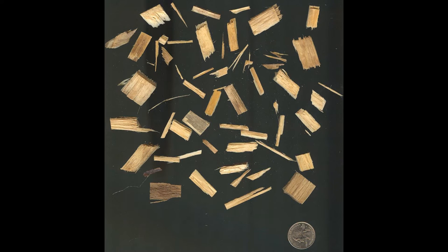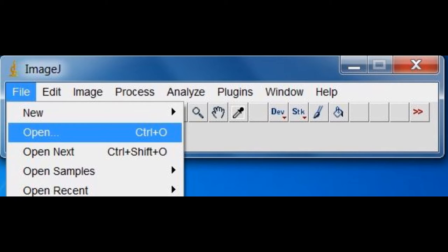Disperse the particles onto the scanner, making sure they are separated and easy to distinguish between the different particles. Include an object with an already determined diameter, like a quarter. Scan the necessary images into the computer to be used with the ImageJ software. With the proper image files and software on the computer, you should be ready to start your particle analysis.